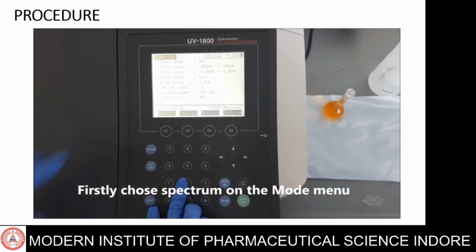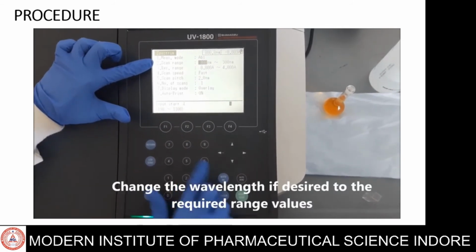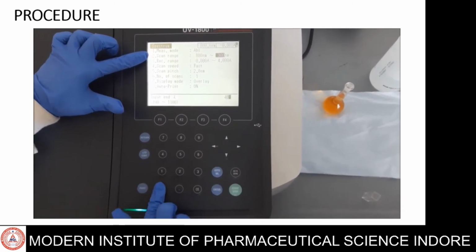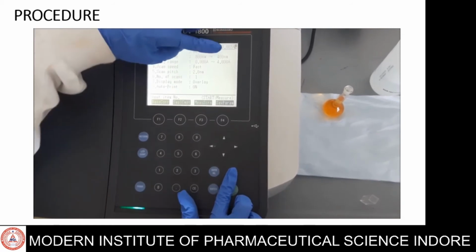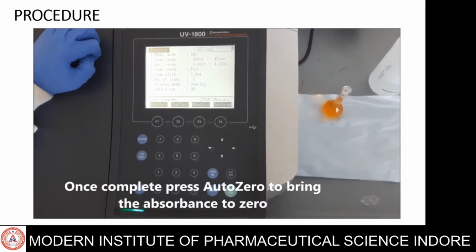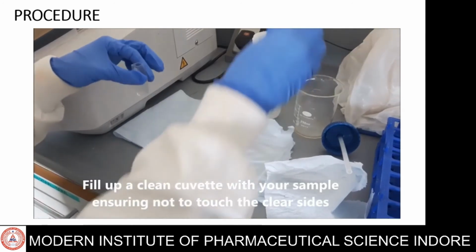Now, first choose spectrum on the mode menu. Change the wavelength if desired to the required range value. Press 2 for range and enter the values using numbers. Once complete, press auto zero to bring the absorbance to 0. Baseline correction next. Press F1 for baseline correction. This removes any background noise.